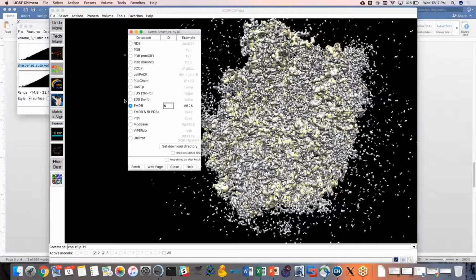It was only 100 micrographs. I don't remember what Dario used, but it was a very small subset. So we'll show you the entire thing, with lots of nice post-processing and using the absolute most optimal data processing pipeline that they could do at the time. So yeah, we'll load that up.